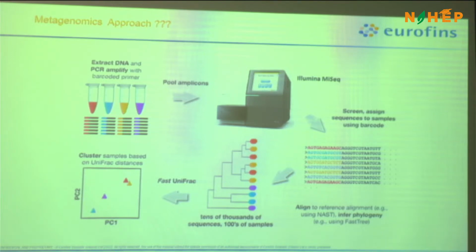We can develop our own custom primers. For example, we were talking about nitrogen fixation. If you want to identify nitrogen-fixing bacteria, we have specific marker genes for that as well. If you want to look at nematodes in a soil sample, there are specific markers for nematodes as well. So we can take those markers, design them with the adapter and sequence it. This is a very economical step to identify the abundance.